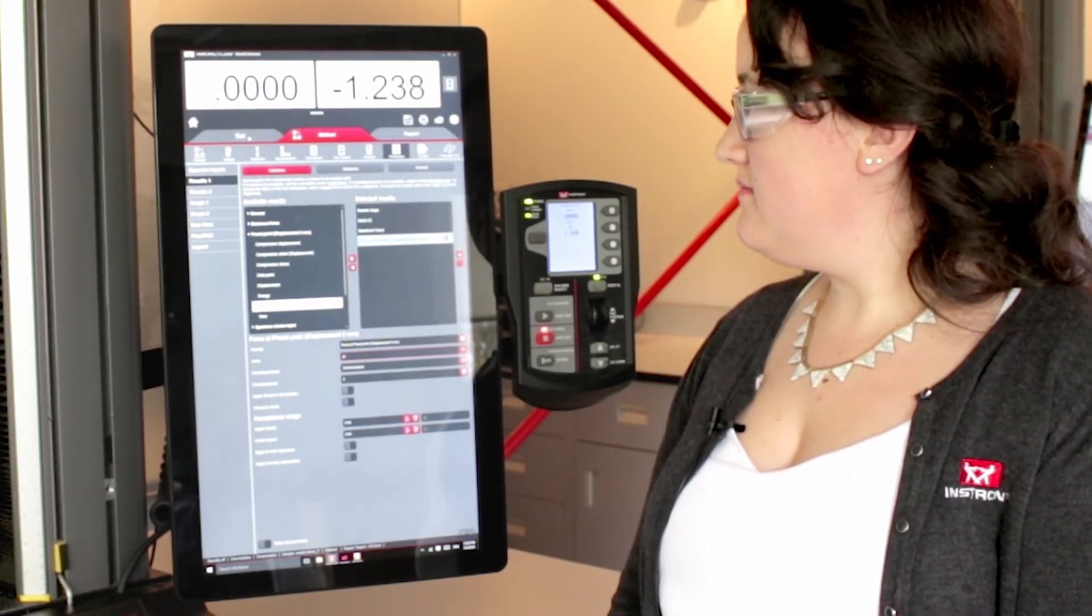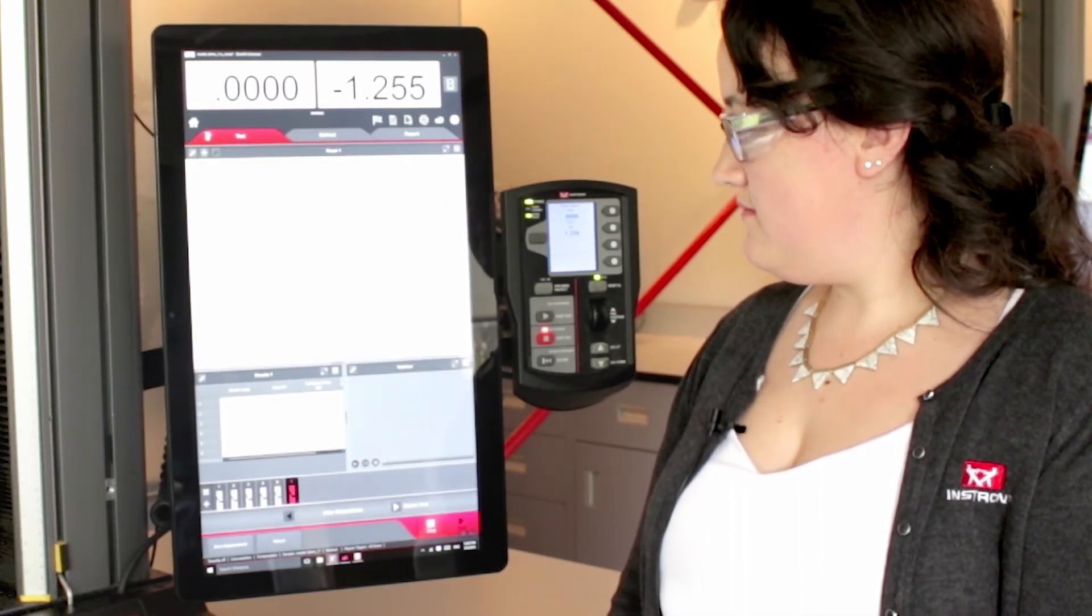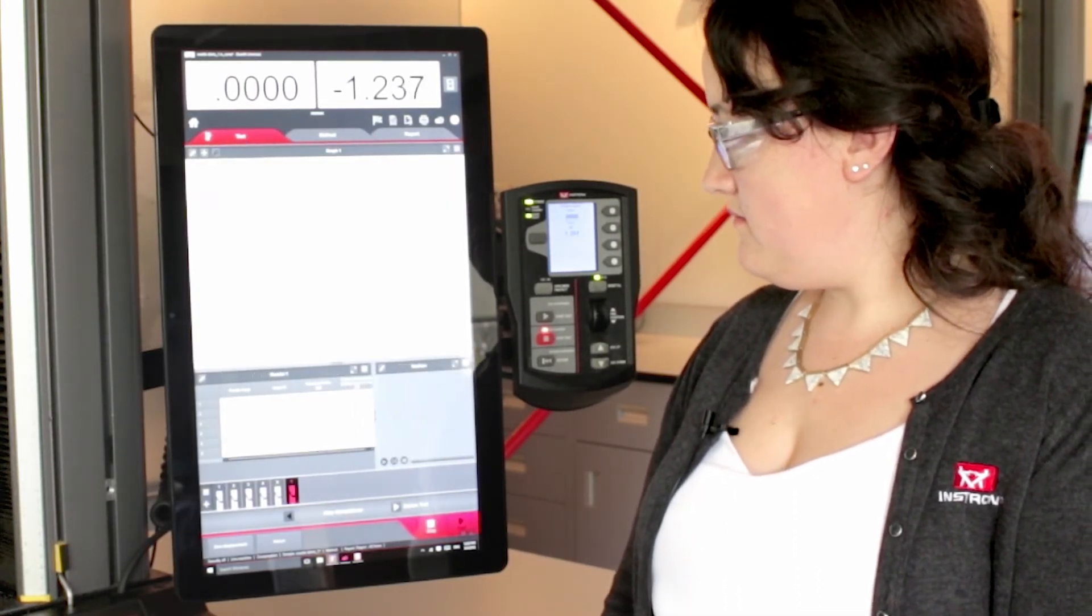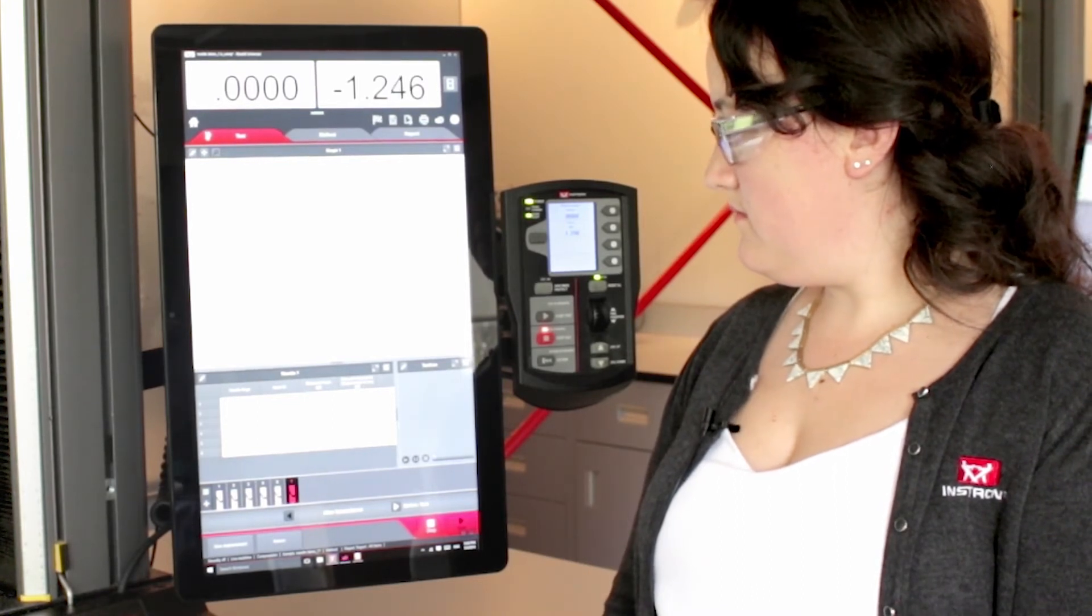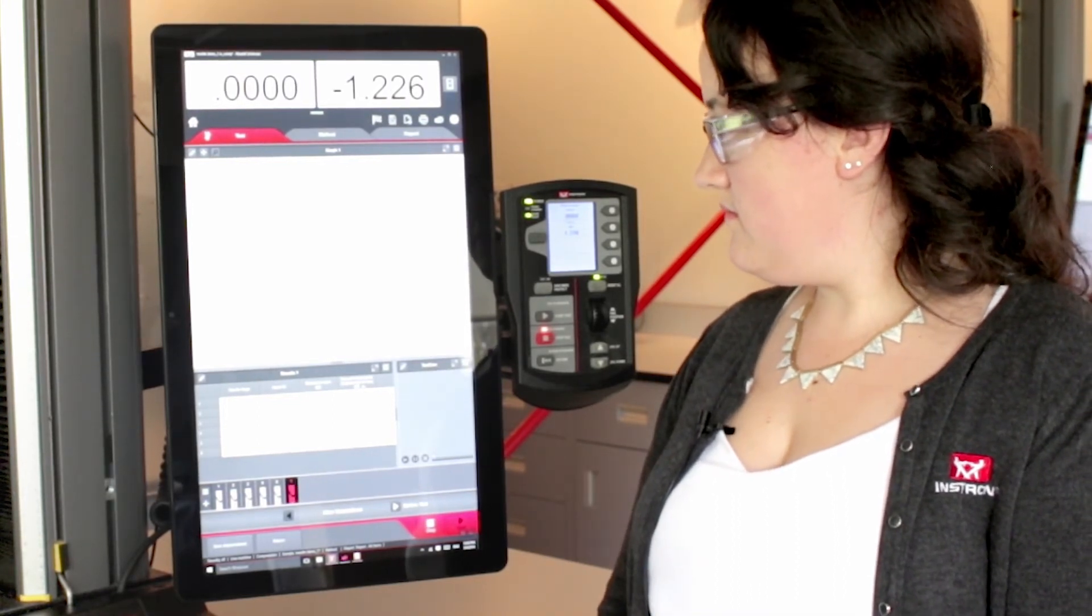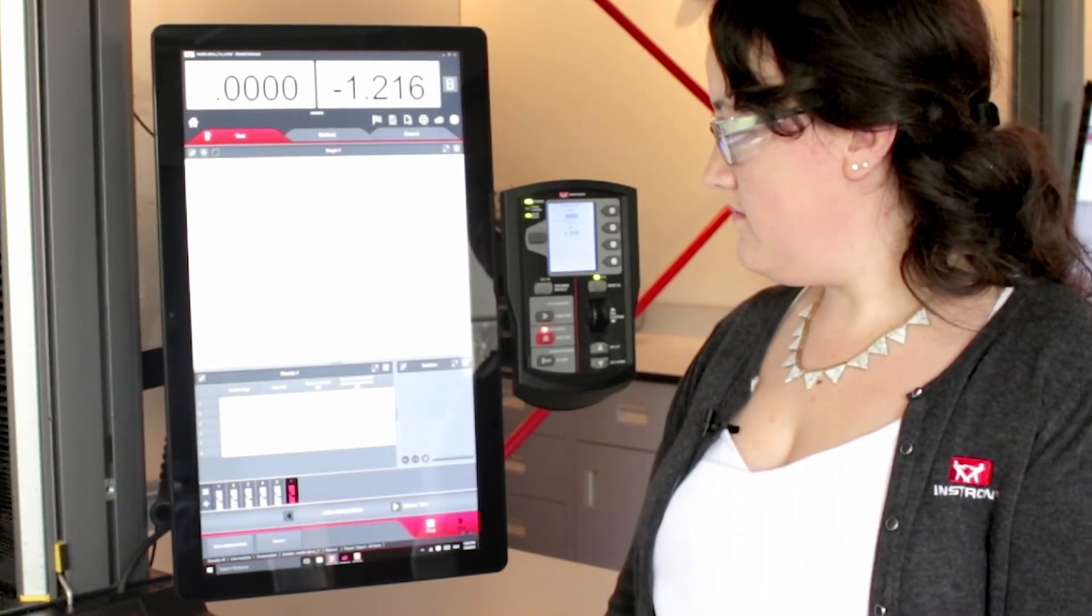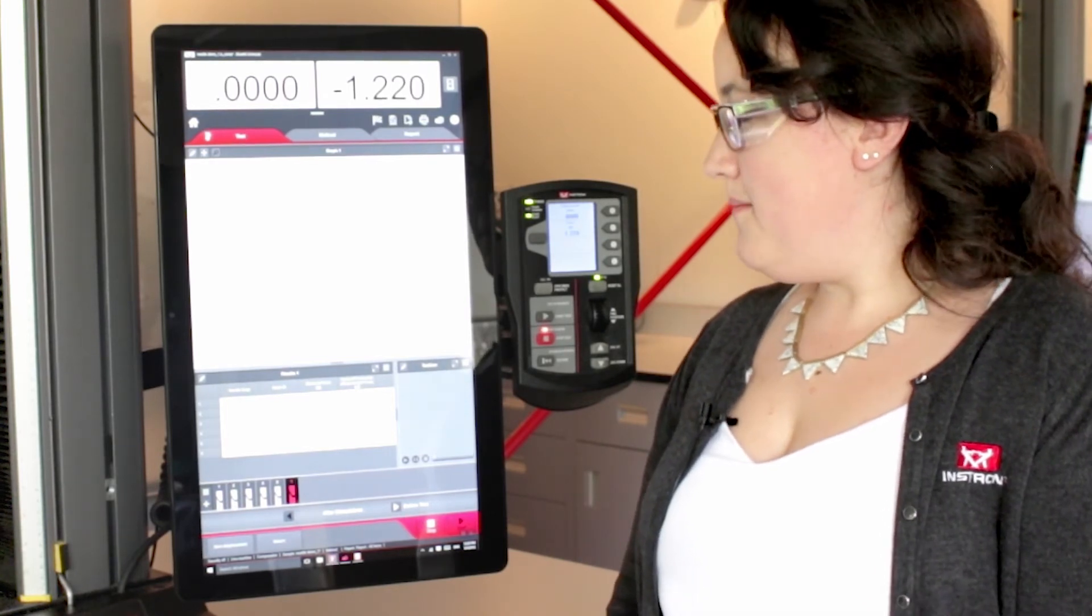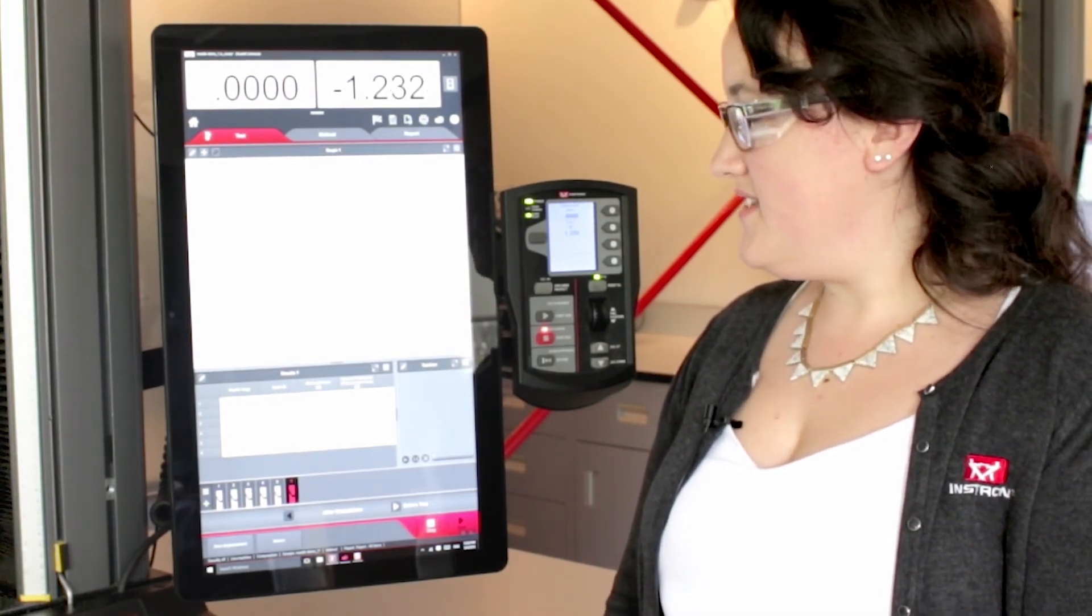All right, so now we'll go back to the test tab, we'll see that our force at our preset point is now set up for you, so it's right there. Anything else I can help you with today?